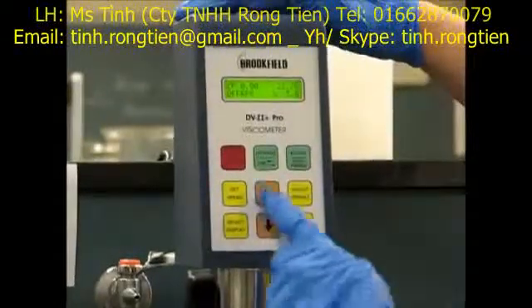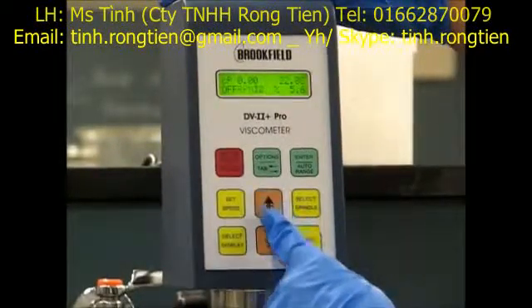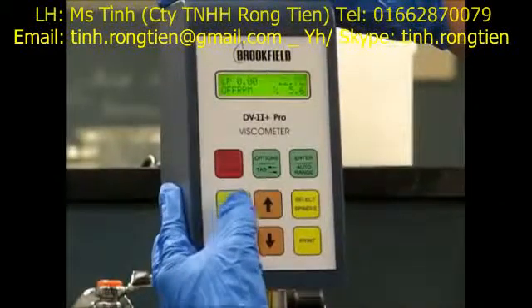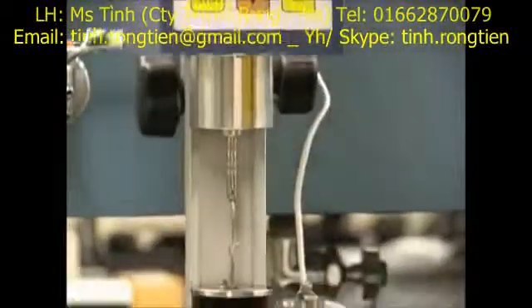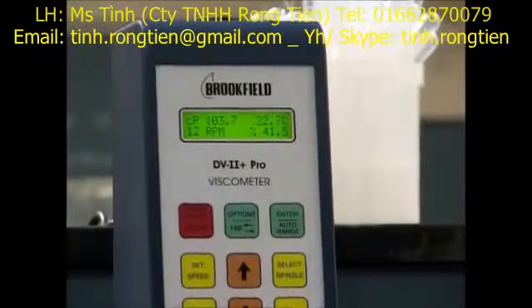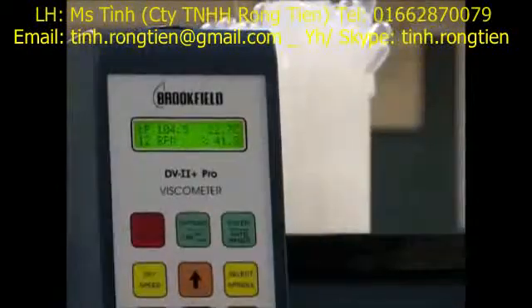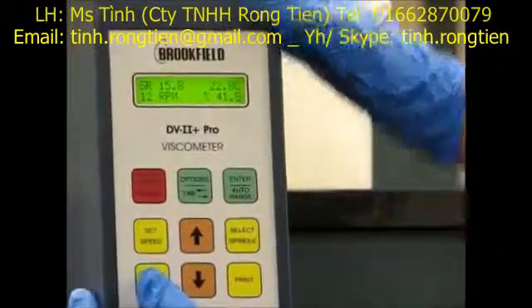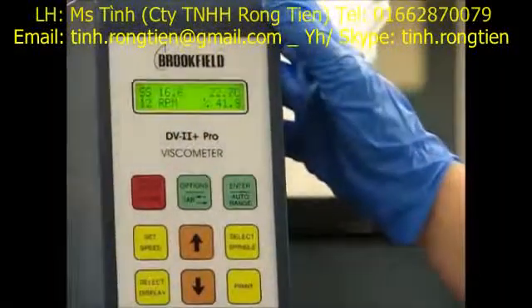Our first measurement will be taken at 12 RPMs. We set the speed and turn the motor on. Our percent torque reads 41%, which is within our acceptable range of 10% to 100%. At this RPM, the viscosity of our fluid is around 104 centipoise. We can also use the select display key to display the shear stress, and pressing it again shows the shear rate. At 12 RPMs, our shear rate is 15.8 and our shear stress is 16.6.